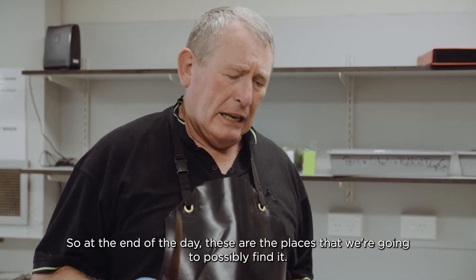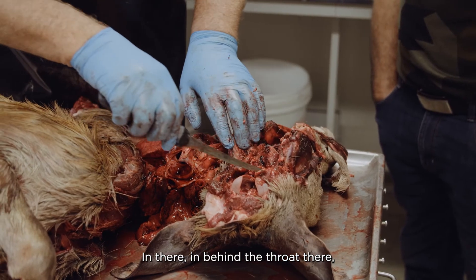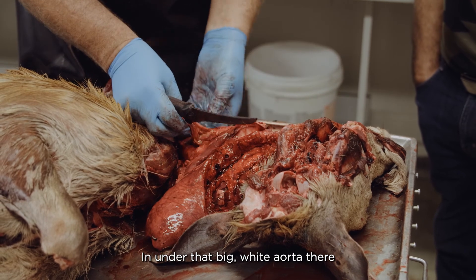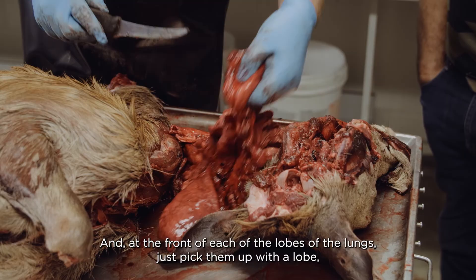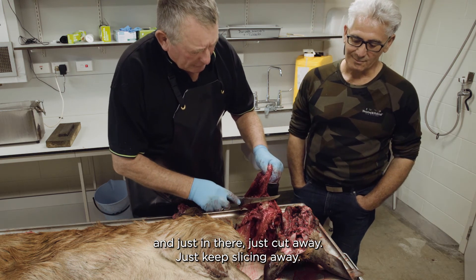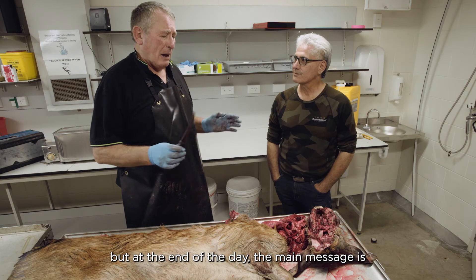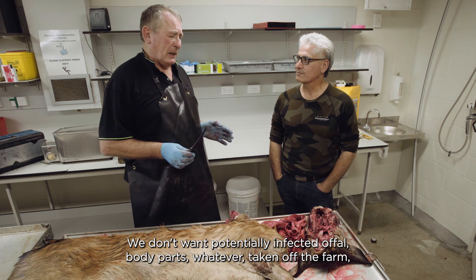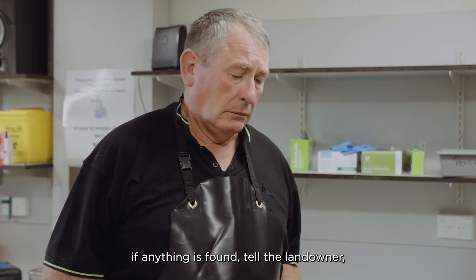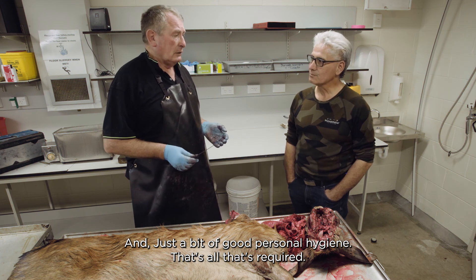So at the end of the day, these are the places we're going to possibly find TB: the point of the jaw gland, in behind the throat, then the lungs - under that big white aorta there's a row of glands, and at the front of each lobe of the lungs just cut away and you'll find the gland in there. The main message is we don't want potentially infected body parts taken off the farm. If anything is found, tell the landowner, let Osprey know, take a few photos, and maintain good personal hygiene. That's all that's required.